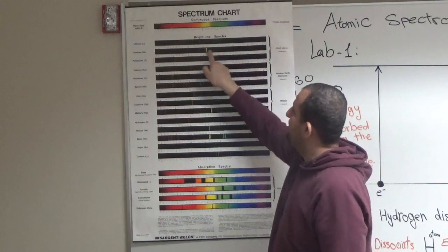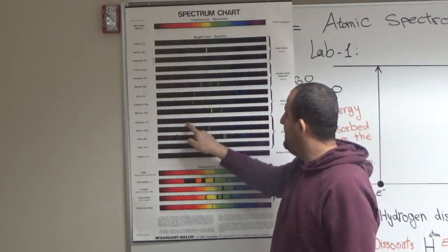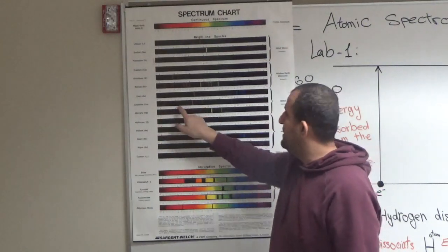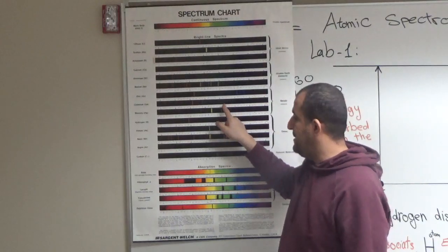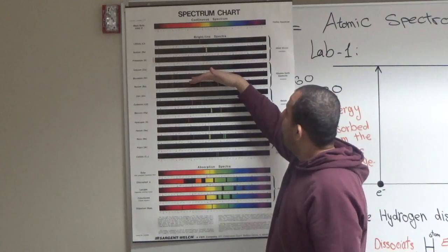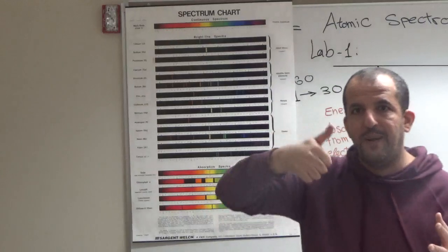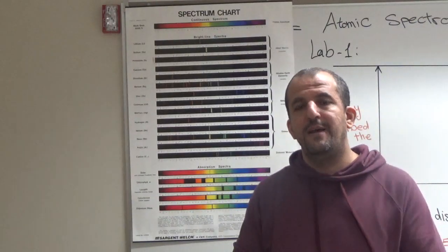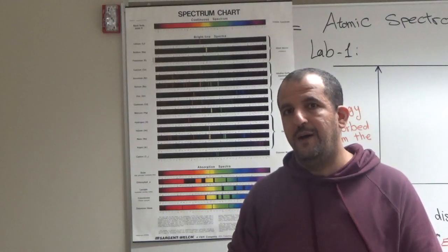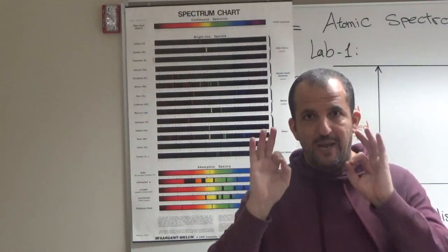This is the spectrum from sodium that we did today, the spectrum from hydrogen that we did today, the spectrum from mercury, which is what we did today, and we use that as the standard. So this spectra can be considered as a fingerprint. Each one of these atoms has its own atomic spectroscopy.